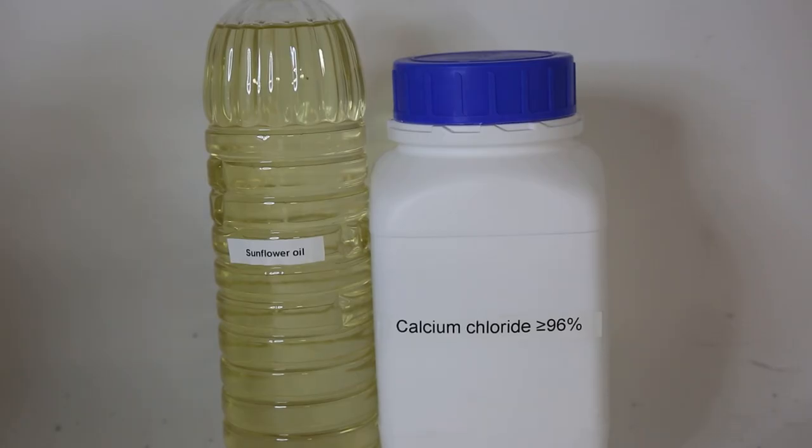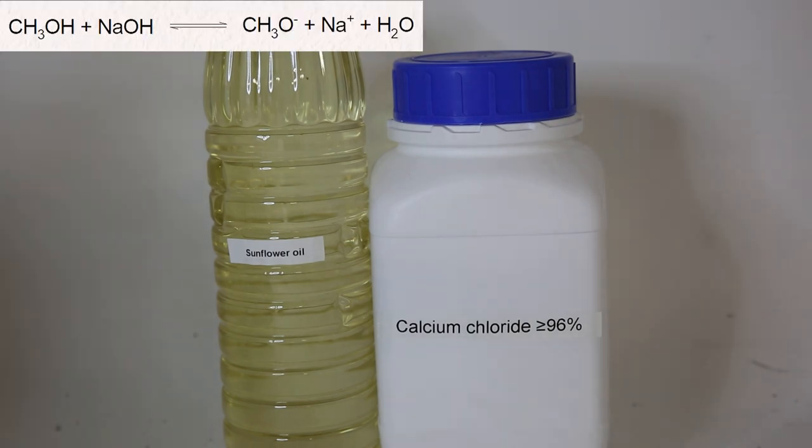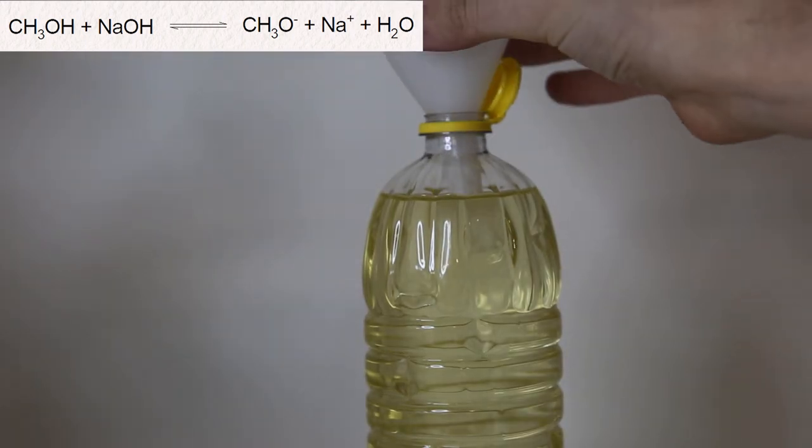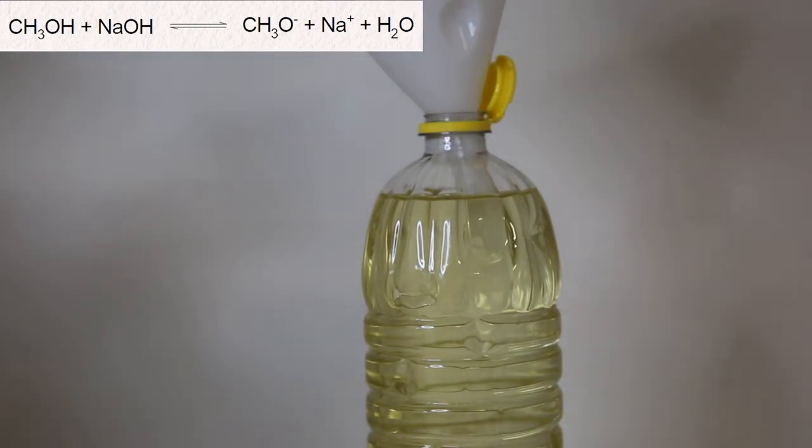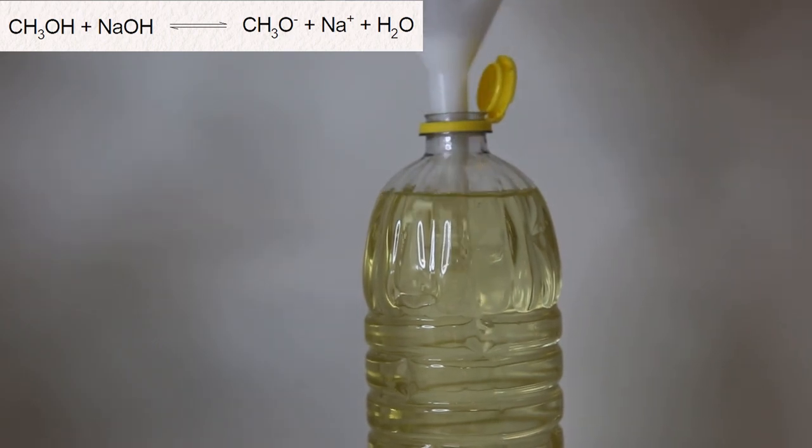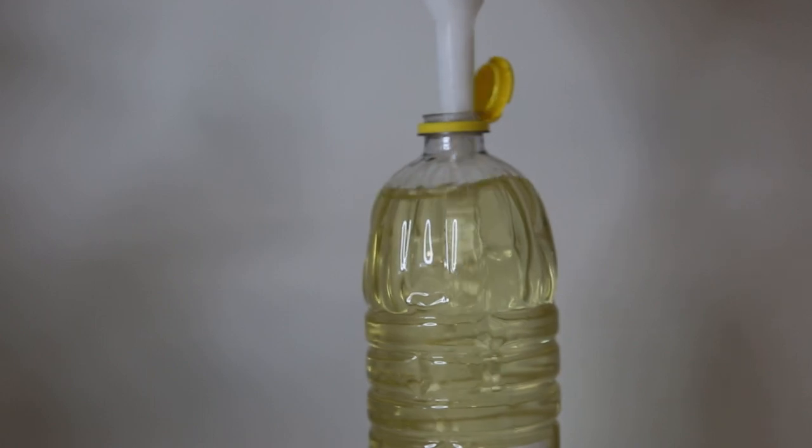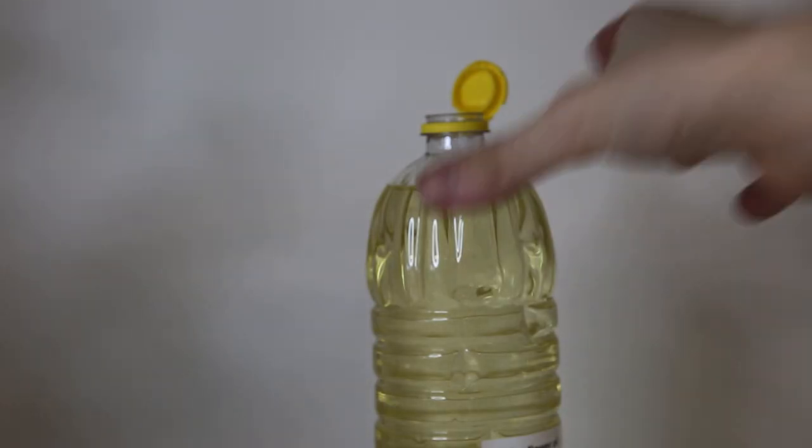So to get started, I will dry the sunflower oil with some calcium chloride. As we have seen, the reaction is in equilibrium with water on the right side. If there is too much water present in the mixture, the equilibrium will start favoring the left side, which will mean there are less methoxide ions, which will decrease the efficiency of the reaction. So removing as much water from the reactants as possible will prevent it from slowing down the reaction. I am not sure what the water content of the sunflower oil is, but I am doing it just in case.